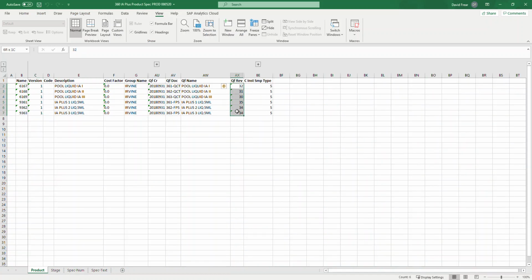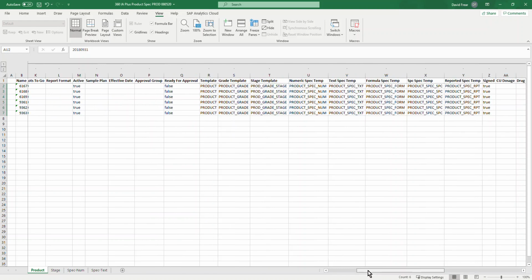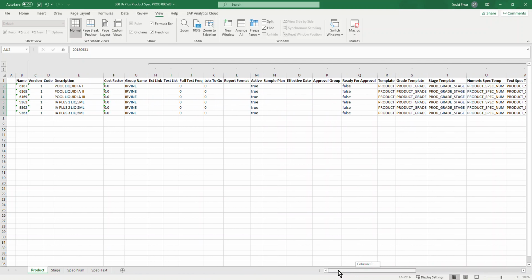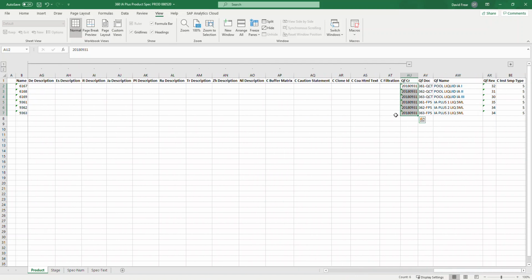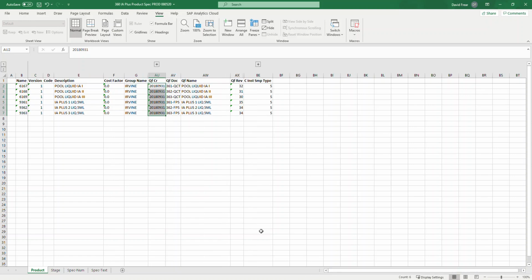So this is where we capture the revision of the documents and the CRs. And you can see these kind of explode out, which there's a lot of extraneous information that's some is being used, some isn't in LabWare, so we've kind of collapsed this down for you. This is the pertinent information I think everybody's interested in.